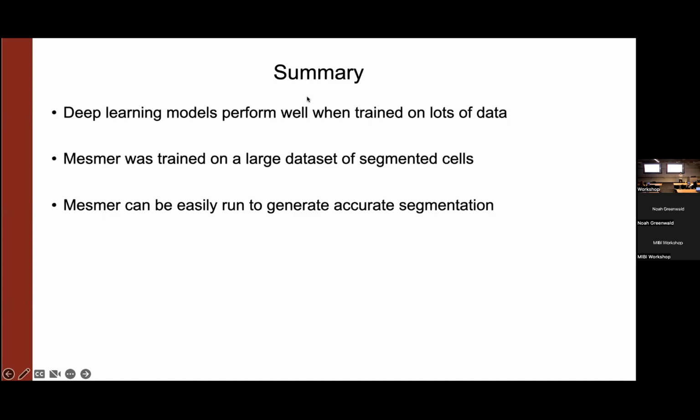The second is where it's hard to tell, even for a human, how to separate those cells, by definition, because of the image data we give it. So if you have a CD4 cell that's smacked right on top of a CD8, what we're giving it is CD45, which maybe is positive for the whole thing, and it's a little bit out of focus, and it's not even clear for a human whether this is 2 cells or 1 cell. Right now, Mesmer doesn't do a good job separating those because we wouldn't do a good job separating those.